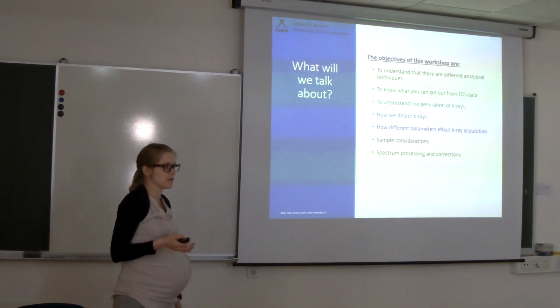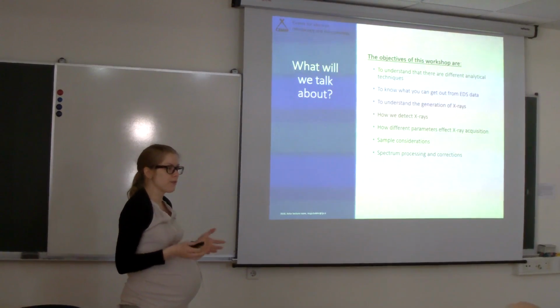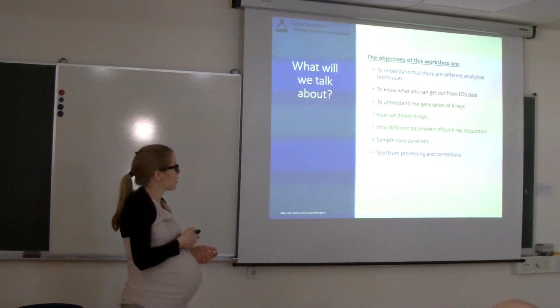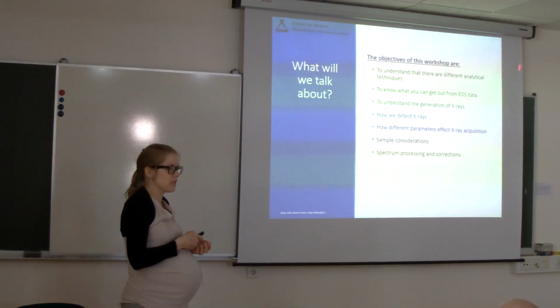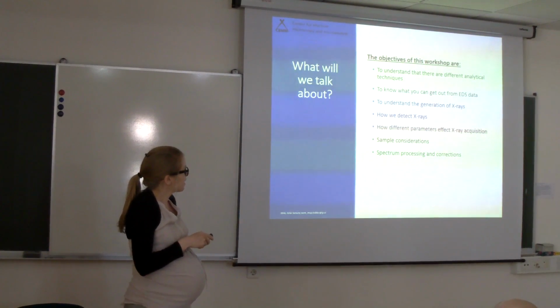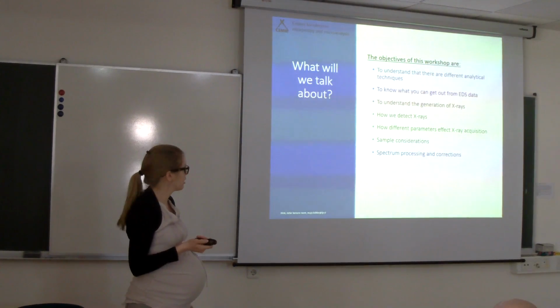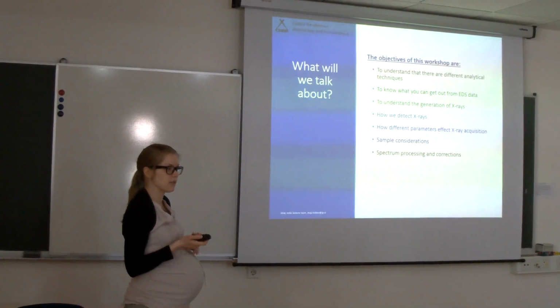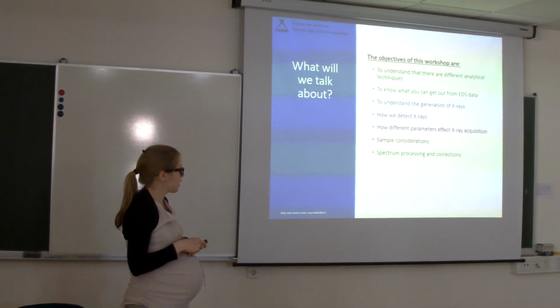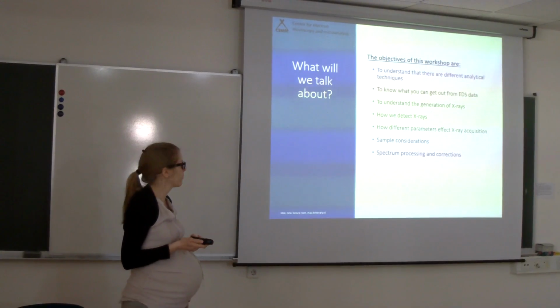What are the objectives for today? I will explain that there are different techniques that you can use for analytical observation and what you can get out of the EDS data to understand the generation of X-rays, where do they come from, and how does that affect the resolution, how we detect them, and different parameters that affect your acquisition, the sample considerations, and how is the spectrum processing and the matrix corrections, how are they done and what do they include.